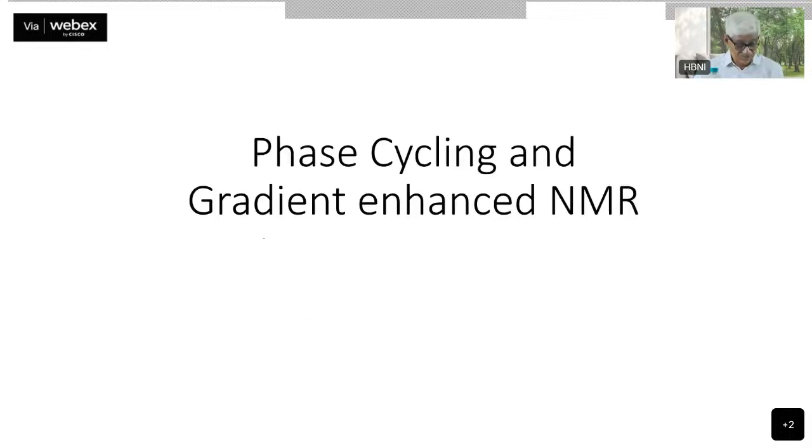Okay, all right. So, welcome, and we can start with this new topic here. This is something which is essential for all NMR experiments. In some parts, we have discussed it already in different pieces. So, this has to do with what is known as phase cycling and gradient enhanced NMR. So, what is phase cycling?